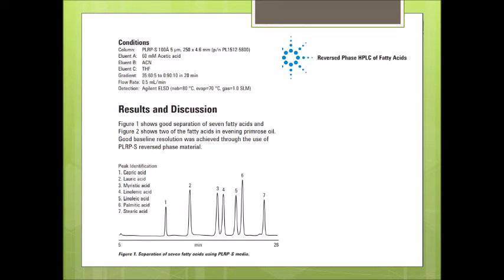Now, as I said before, with your magnesium stearate, maybe you will end up seeing some palmitic acid, so don't be surprised if you see peak 6 in your sample. I would even predict that with some materials you may see 50-50 palmitic versus stearic, or some of them maybe 10-90, or some of them a lot less palmitic. So don't be surprised. This is a very good method, and it doesn't need any methylation. It is very straightforward.